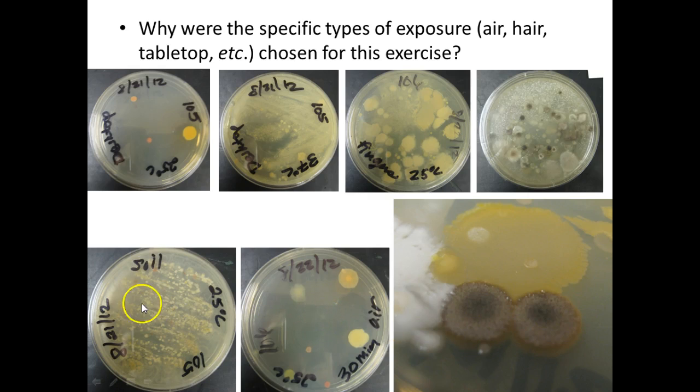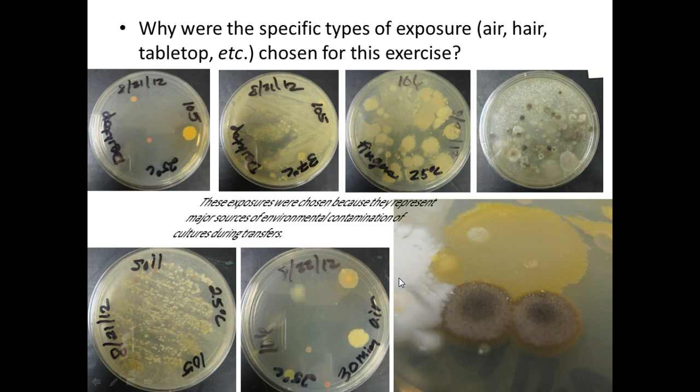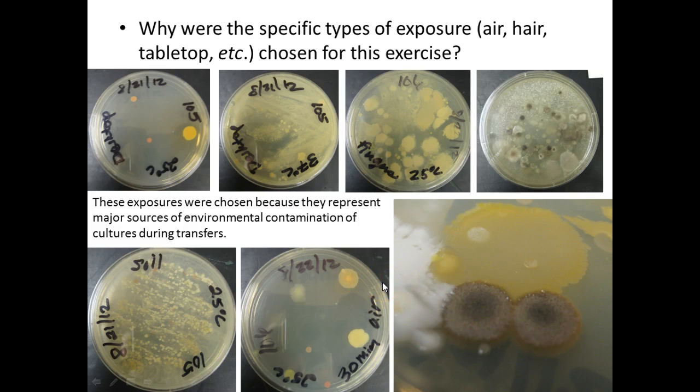So that's typically why I have you guys do the soil of the leaf sample, because up until that one crapped out, we had a HEPA filter running in here, which eliminated a lot of the mold spores in the room, which helped keep our stuff from getting contaminated with mold. But it's in the air, or you brought it in. So these exposures were chosen because, again, to represent the fact that microorganisms are everywhere, right? We tested the air, the soil, our fingers, the desktop, our nose, our mouth. Microorganisms are found everywhere.